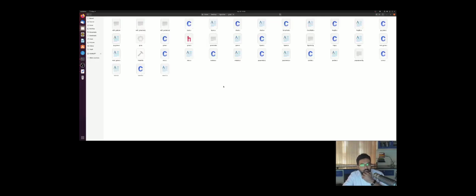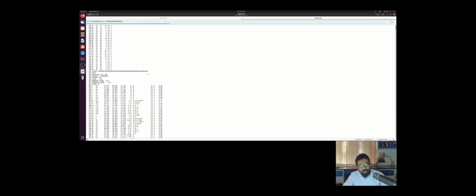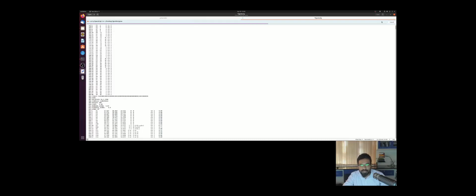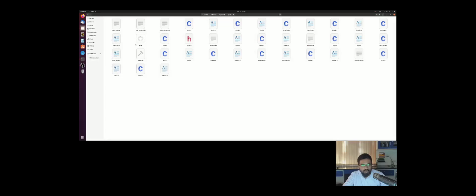Here are two output files, population.lig and ligands.lig, right? These are the files in which all the newly generated ligand molecules, or details of those ligands, are written. Let me show this. Open with the text editor. Here you can see the small molecules, right? All the details of the newly generated molecules are written inside this file. I'm closing this file and going to the next step.